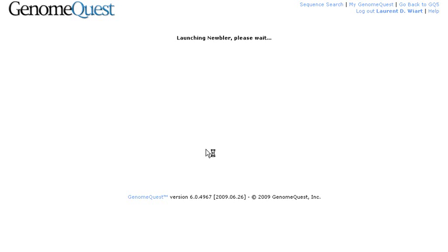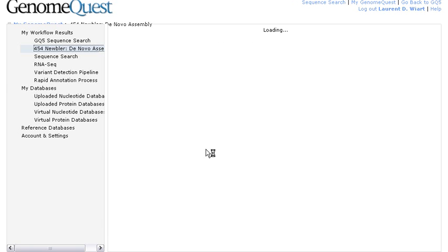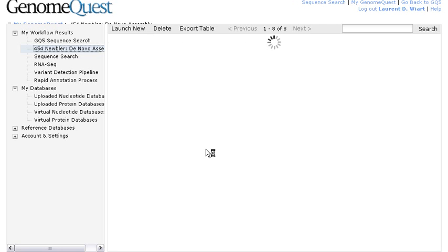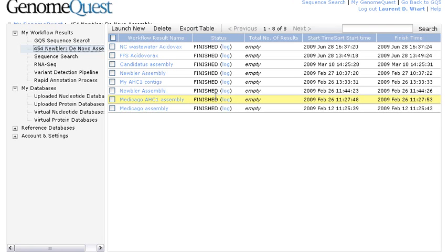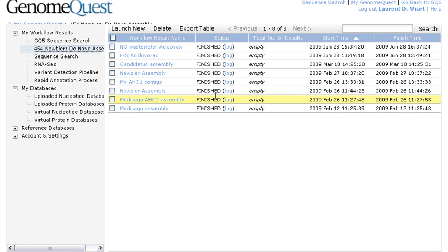So now let's export those reads to the Newbler assembly tool, and you will see the new MyGenomeQuest page showing up with another entry in MyDatabases, which is going to be the NC wastewater Acidovorax. Now, it's going to take a few seconds to work, and now you can see that it's finished.